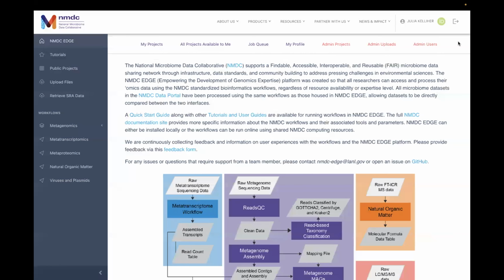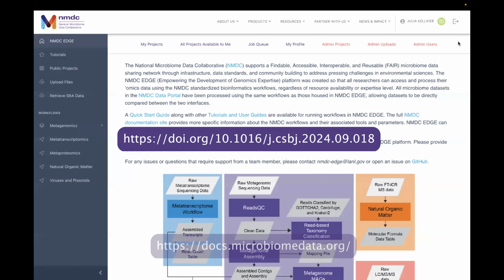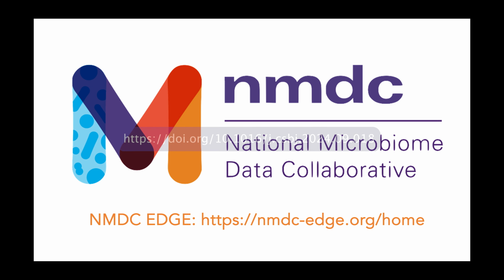NMDC EDGE is an open-source, user-friendly web interface designed to make the NMDC bioinformatics workflows accessible to any researcher that is interested in processing their microbiome data, no matter their experience level. This video will walk you through the basics of NMDC EDGE and how to process data through the NMDC workflows. If you'd like to learn more about NMDC EDGE or our workflows, visit our documentation site here or check out our publication. Here is the URL for NMDC EDGE.